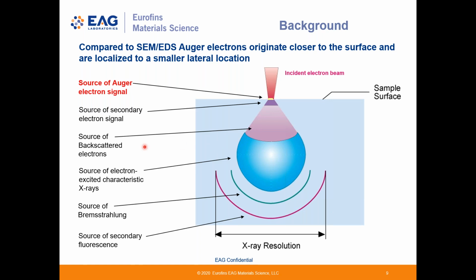And actually, since you're on that slide, there was also a question about the scale of that diagram. Yeah, this should be about a micron, I think, down to this level, and this is about 10 nanometers. So I don't think it's quite drawn to scale, but that's about the characteristic escape depth for X-rays down in here.